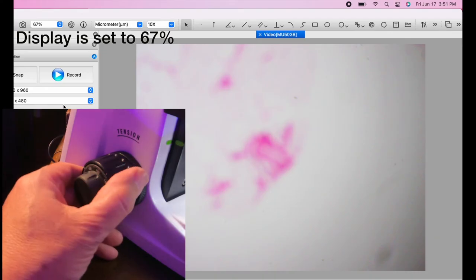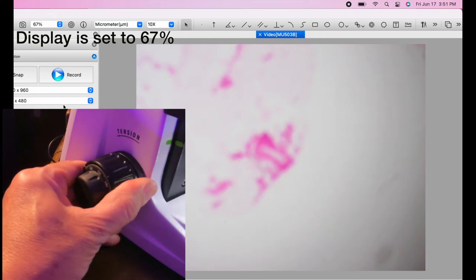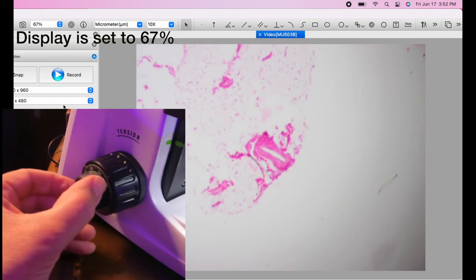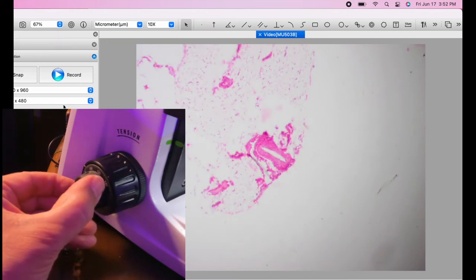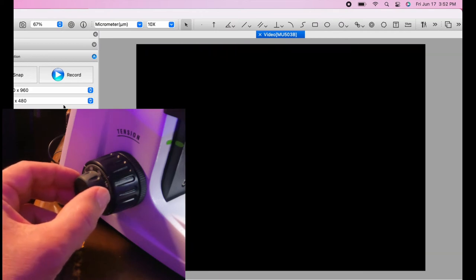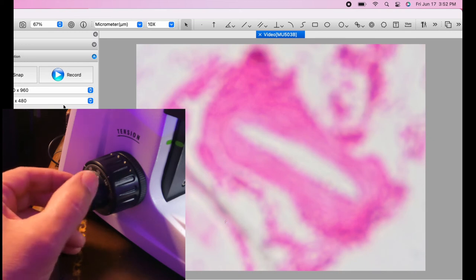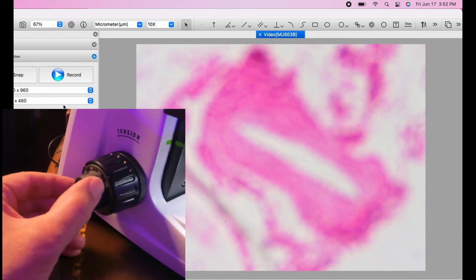and we're going to do the exact same thing we did before to see how well these lenses work. So now I will use the coarse adjustment to get the object in focus using the 4x lens. And that looks about right. Now we'll switch to the 20x lens. And now we just have to make a slight adjustment.